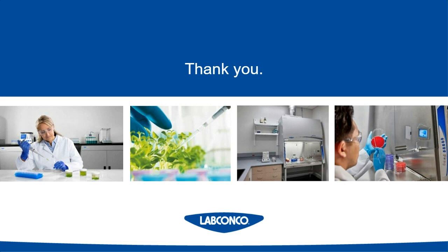So the A/B3 cabinet has been replaced by the Class II type A2 cabinet currently. So if you're looking at replacing an old A/B3, your direct replacement on today's marketplace would be the Class II A2.